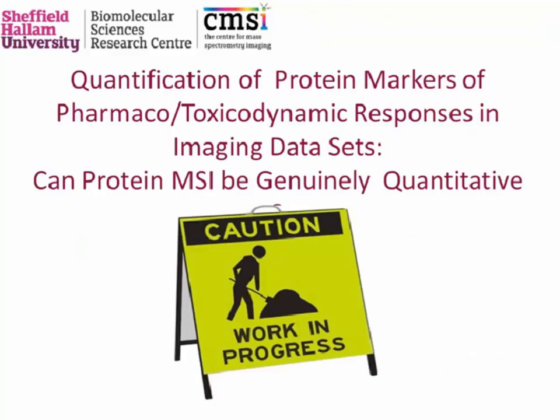A real challenge in mass spec imaging, and particularly quantitative mass spec imaging, is to actually quantify protein markers. There's very, very little work in this area carried out using organic mass spectrometry. There's a bit with inorganic mass spectrometry and labelling antibodies, but little with organic mass spectrometry. So we were funded by NC3Rs, the Research Council in the UK that fund research that can lead to the reduction or refinement of animal use, to see if we could actually make the protein mass spec imaging genuinely quantitative.